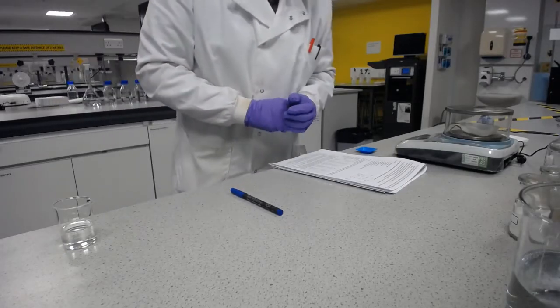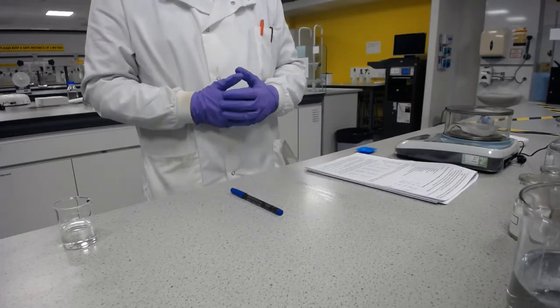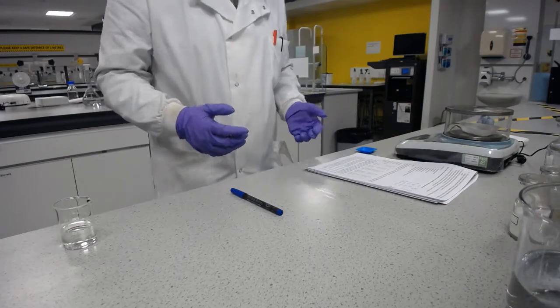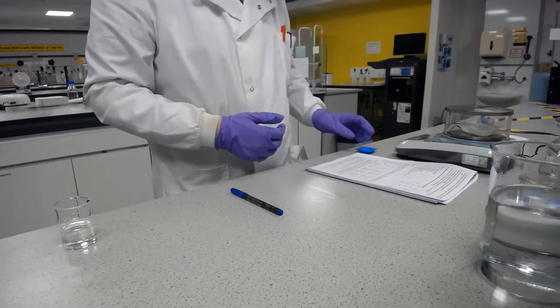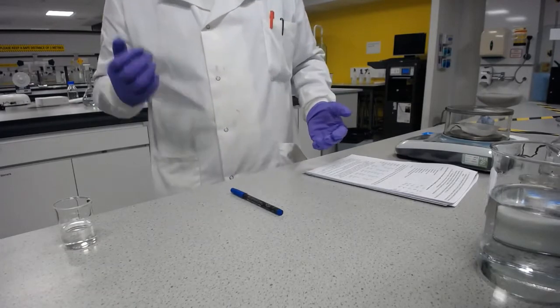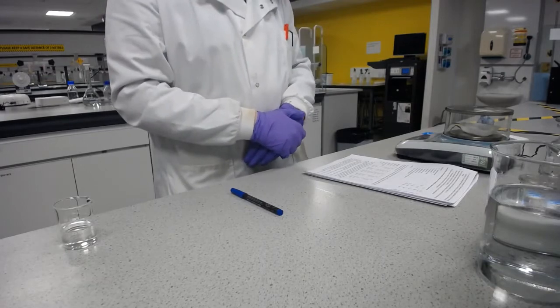So now in the second part of this lab, we're going to be making up 5 different formulations of calamine lotion. And we're going to be putting different excipients into each one. We can see we've got calamine, of course, zinc oxide, bentonite, trisodium citrate, glycerin, and of course water as the vehicle, as the last part to make it up to the final volume. On that point, we can see here that it says water to 50 millilitres. Now, just to remind you again, that doesn't mean you add 50 millilitres of water. It means you add everything else first, and then you add enough water to top everything up till it reaches 50 millilitres as a final volume.